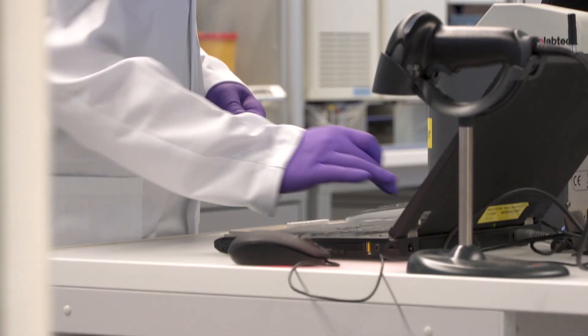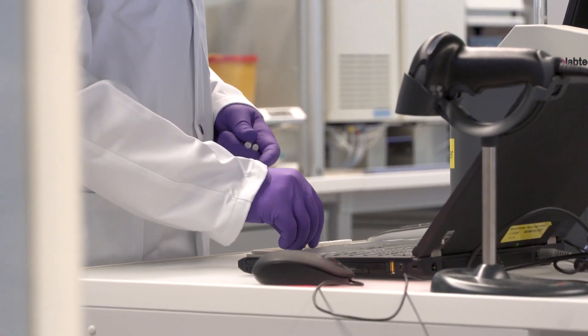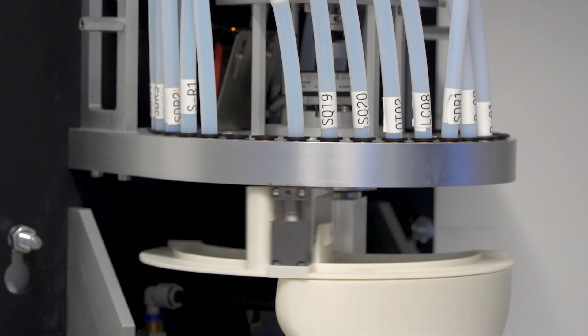A barcode tells the computer which protocol to use. The system uses the power of air to send the sample through the network of tubing to the right destination.